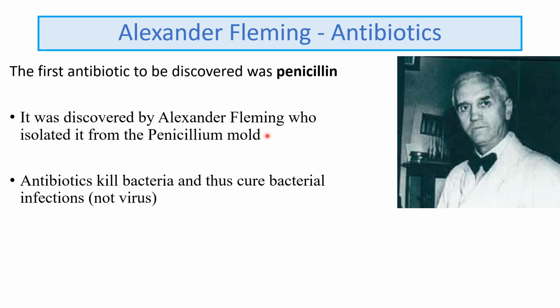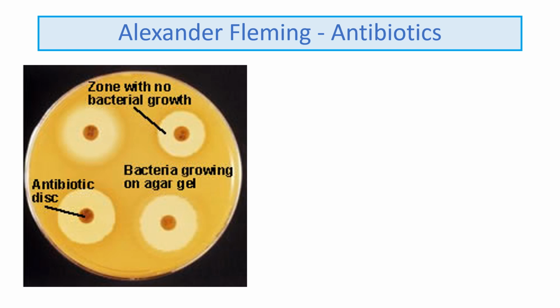an agar plate. It also is important to know that antibiotics kill bacteria and cure bacterial diseases, but they are not a useful drug against viruses. They do not kill viruses. What would you be expected to know then? What you'd be expected to know is something like this.